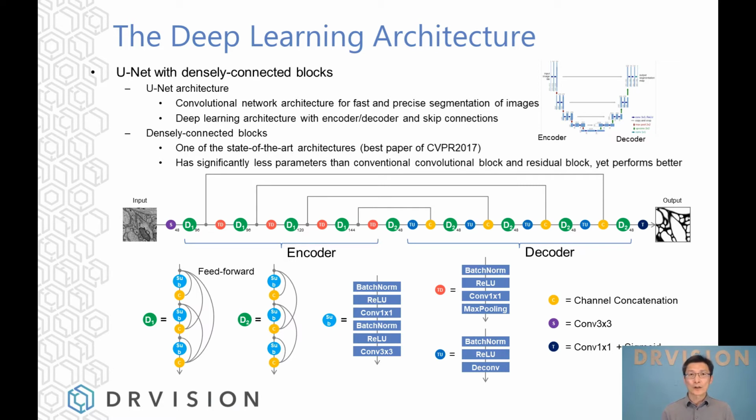With the decoder, the UNet is capable of generating outputs with the same size as the input image and performing pixel-wise classification. That makes it suitable for EM segmentation.